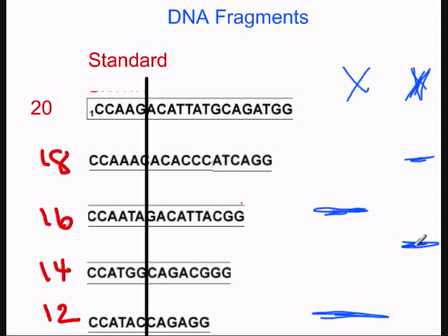Now, if you match up the DNA profiles, the child should have part of its fragments from the mother, obviously, and should have the other fragments from one of the fathers. And we don't know if that's the husband or the suspect. But there's one more problem. Size is not the only way to tell the difference here. What we have to do is something called radioactive labeling.